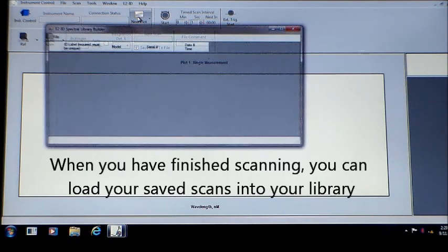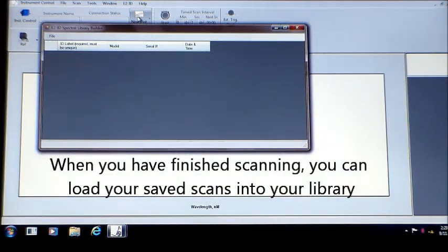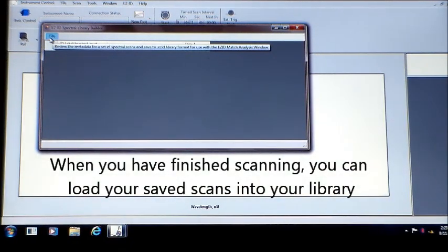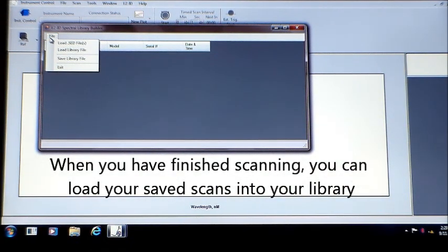Once all your scans are saved, load them to your library. Name the library and it is now ready to use.